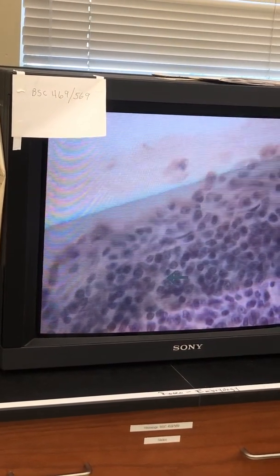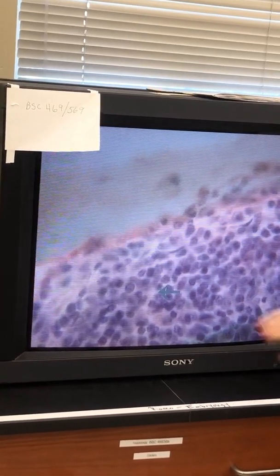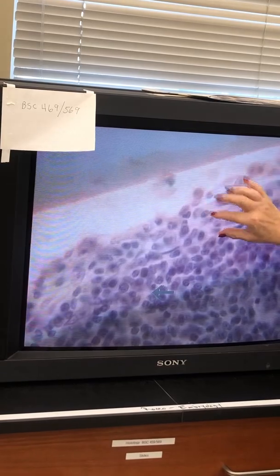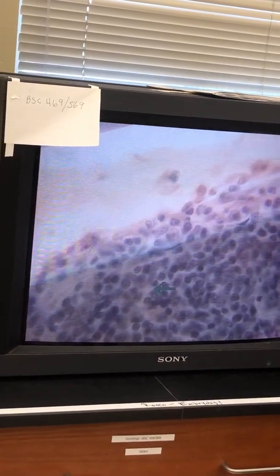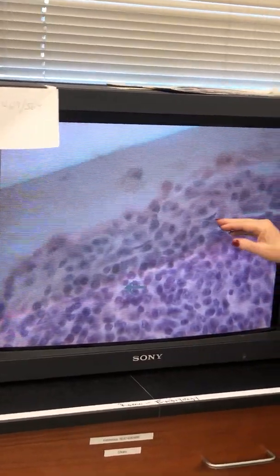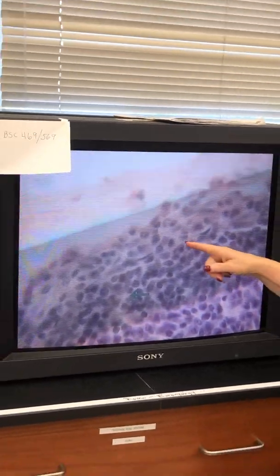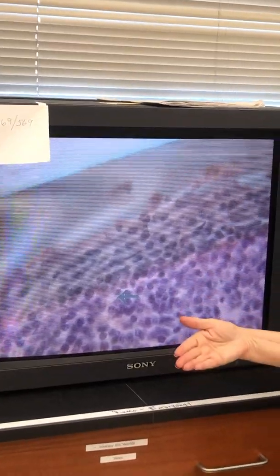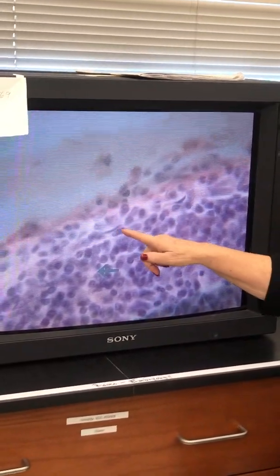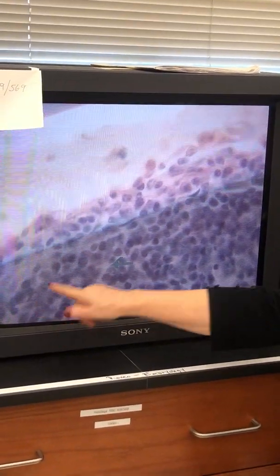Do you see these elongated cells right there? This is your sinus, right here, the subcapsular sinus. These are cells that are lining it. And these are nuclei of the cells, right? So what happens is, the cytoplasm is extending a little bit further. And when you do a cut, it may be on a different plane. So you'll get one here, one way over here. Essentially there would be another couple, and then you could see it just lining.